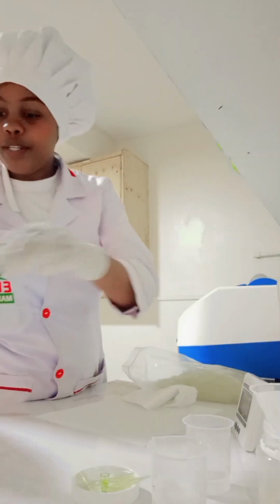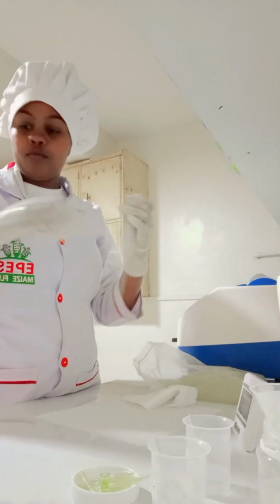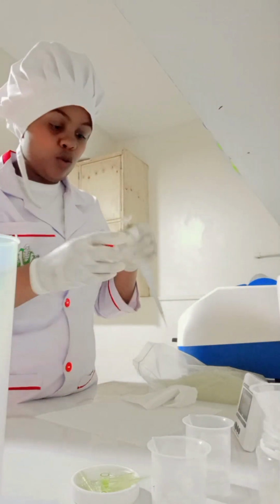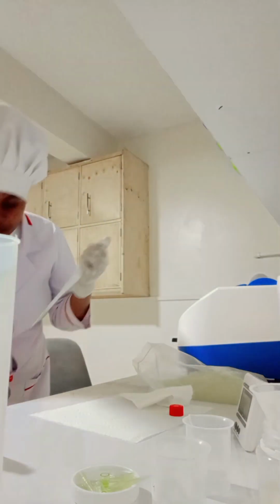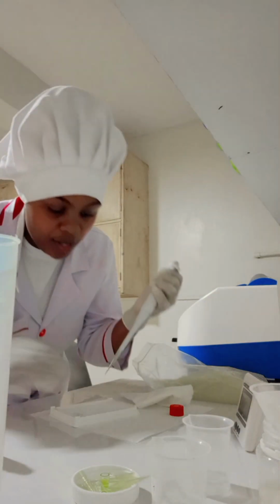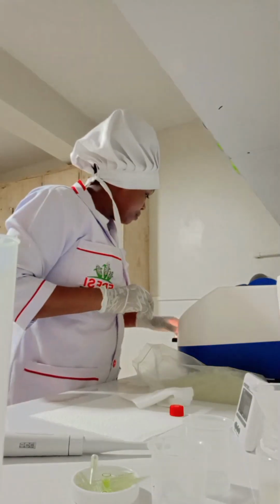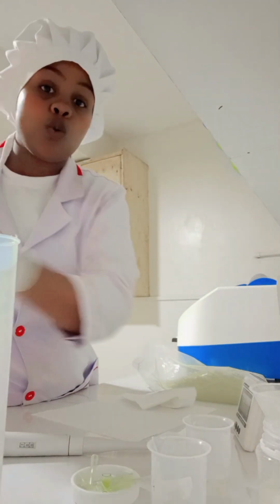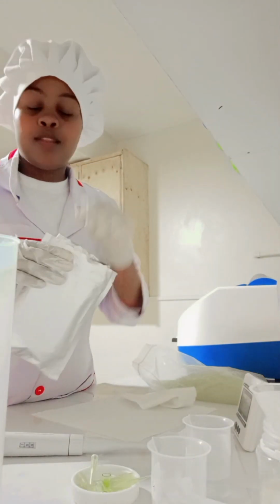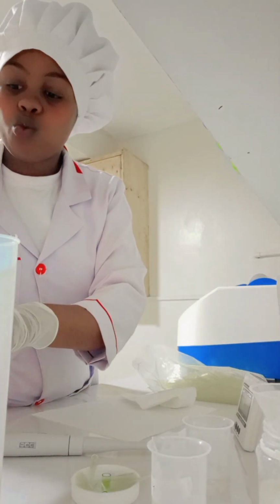I think we were done with the 5 minutes. Now I was to read the results. I think so, yeah. Oh, I was adding the stop solution after the 5 minutes elapses. I added the stop solution to stop the reaction from taking place, and immediately you read the results. Yes, and that's what happens when doing the aflatoxin test.